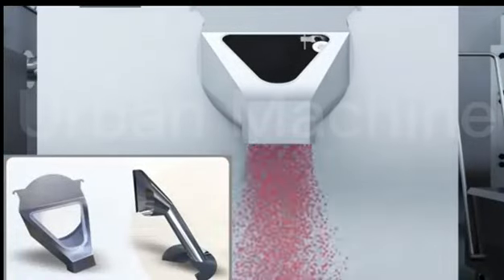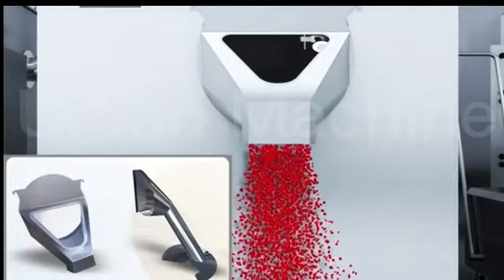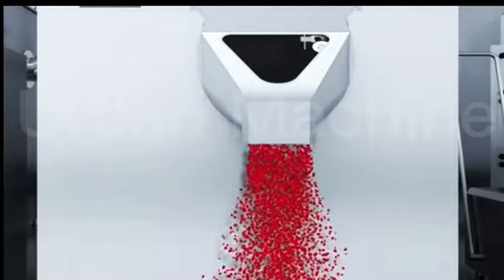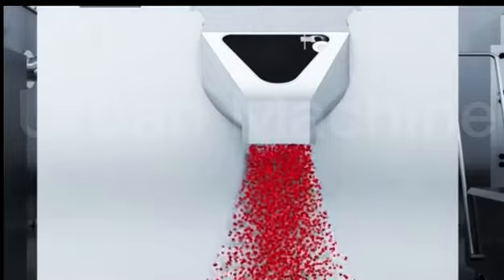The machine consists of outer and inner hopper. Discharge is performed automatically by the rotating drum.